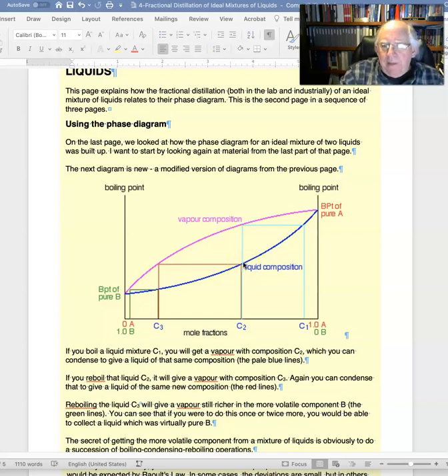That liquid then would have a boiling point that corresponded to this point here. Now, where is that liquid? Well, in our column, the liquid can't be the original liquid, but as the vapor condenses up in the column, it lands on a marble that is at a little bit lower temperature, so it condenses, and we have a liquid that is wetting that particular marble.